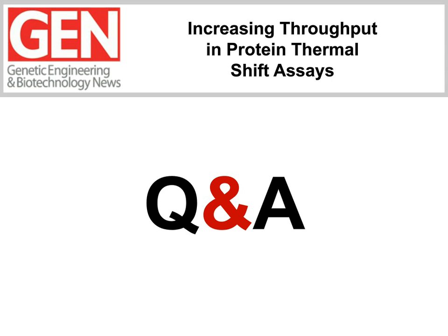Once you figure out, let's say that your TM or your delta TM is probably like 5 degrees, and you picked up your without and with the ligand, probably somewhere around 60 and 65, then you really don't have to start off from, let's say, 30 or 40, and you really don't have to go all the way till 90. So you basically narrow down the melt to around 50 and 80. And then you increase the number of data points in that range. So that's how you actually build the resolution, and you can make it up all the way up to 25 acquisitions per degree. And that would be more than enough to actually pick up a resolution as close as a difference of delta TM of around 0.2 degrees. And delta TM of 0.2 degrees, I think it is a high enough resolution to differentiate, especially in the melt curves.